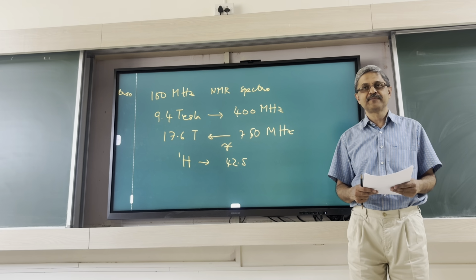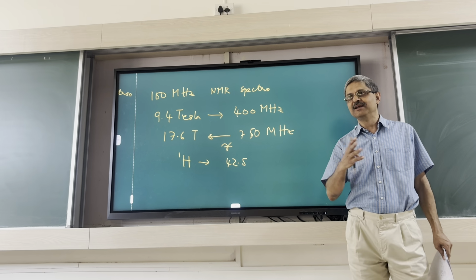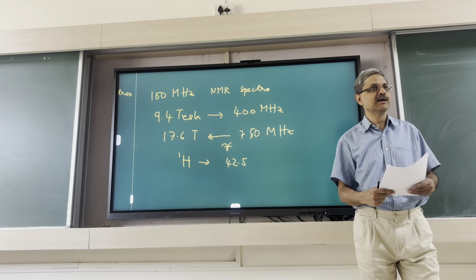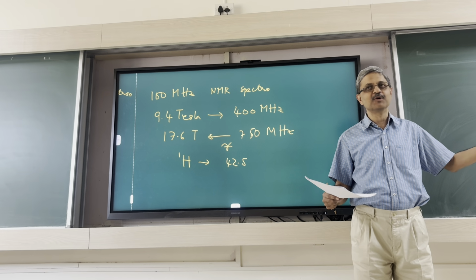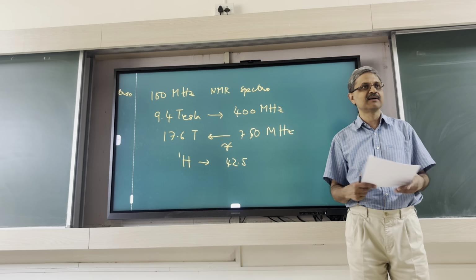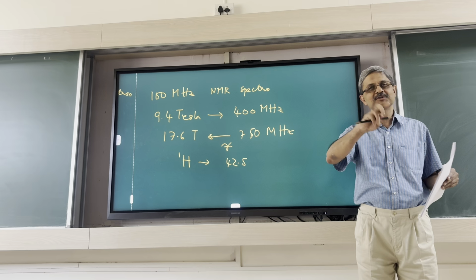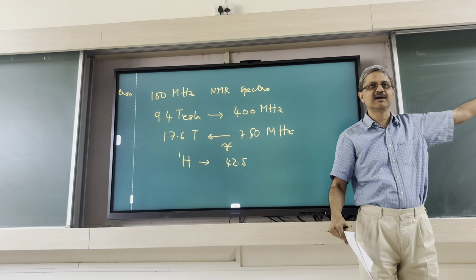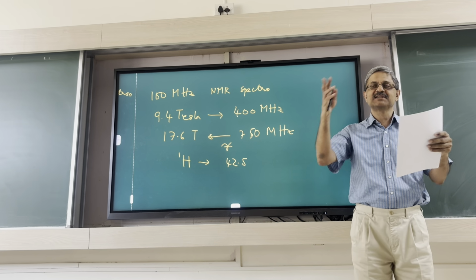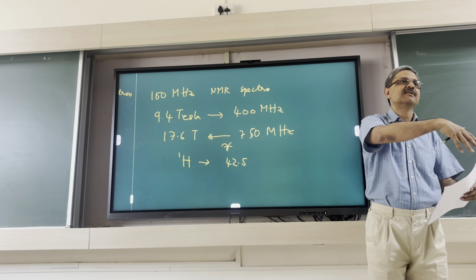So again, since you brought this topic, if you are recovering all the liquid helium, right? Helium is always boiling. Inside it is 4.2 K, outside 300 K. So it's always boiling, so gas is coming out. You don't want to let it go. So you might have seen recovery lines. It recovers, gets into a big gas bag, then it's compressed back into cylinder.